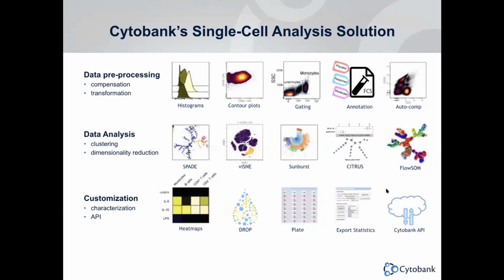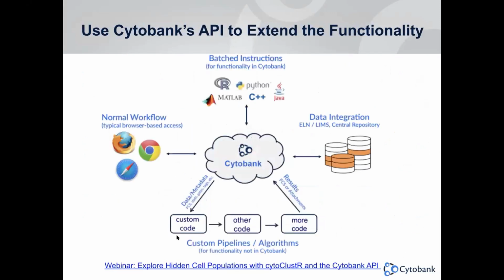Another important feature we have is the Cytobank API. People with coding skills can extend the functionality with this tool to interact with the data stored in Cytobank. We have a few webinars available on using the Cytobank API in the slide. Actually, it's over here. On our Cytobank YouTube channel, you will be able to find this webinar recording about how to interact with the Cytobank API using CytoCluster R, which was featured by Dr. Shahram as well.